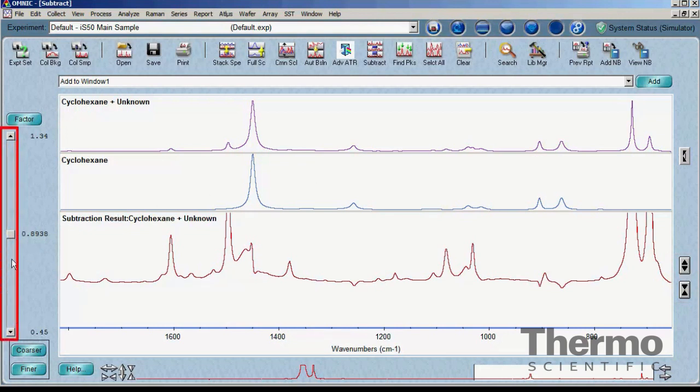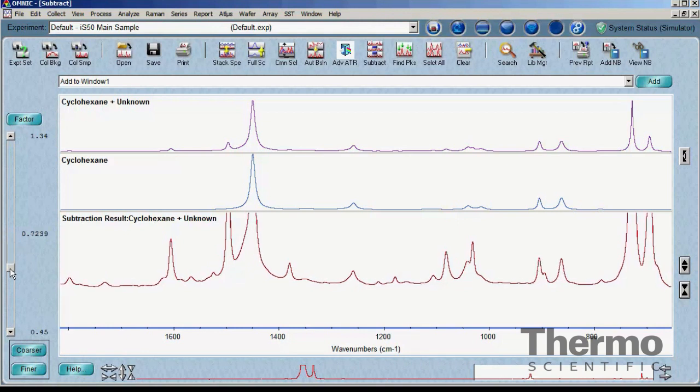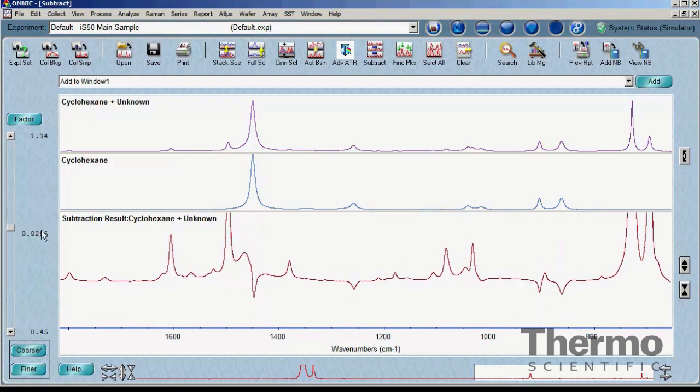Using the vertical slide on the right side of the subtraction task window, the scale factor can be interactively changed while viewing the subtraction result. A good setting is when all the peaks seen in the reference spectrum were removed in the result, keeping in mind that some peaks may be present in both. The reference peaks should not be positive or negative in the result, and by moving the slide up and down, peaks will be seen to go positive and negative, allowing for a good midpoint to be found.